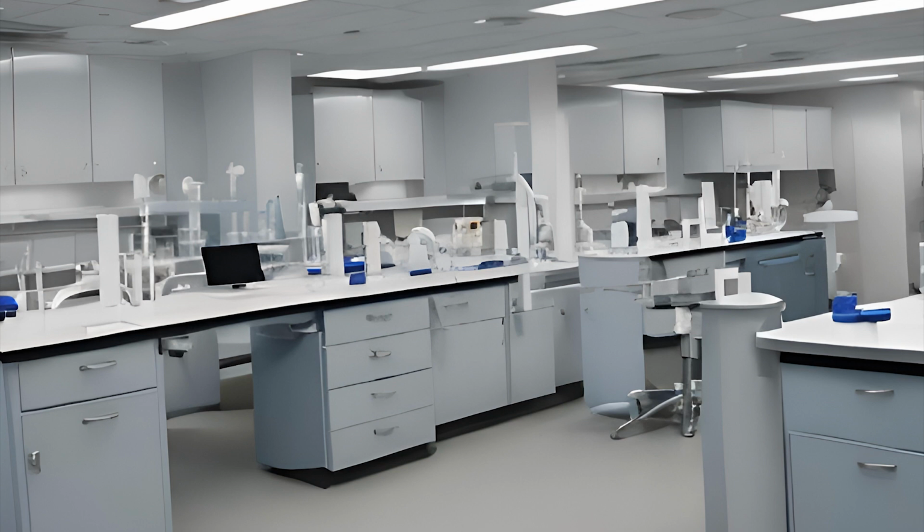If you're running something like a bilirubin test that needs to be protected from light, and they don't transport it in a light protecting container, or someone provides the wrong transportation temperature for a sample, it can destroy what you're looking for, and then you won't find it. It could be there in the patient, but because the sample was transported wrong, it's not there in the sample when you test for it.